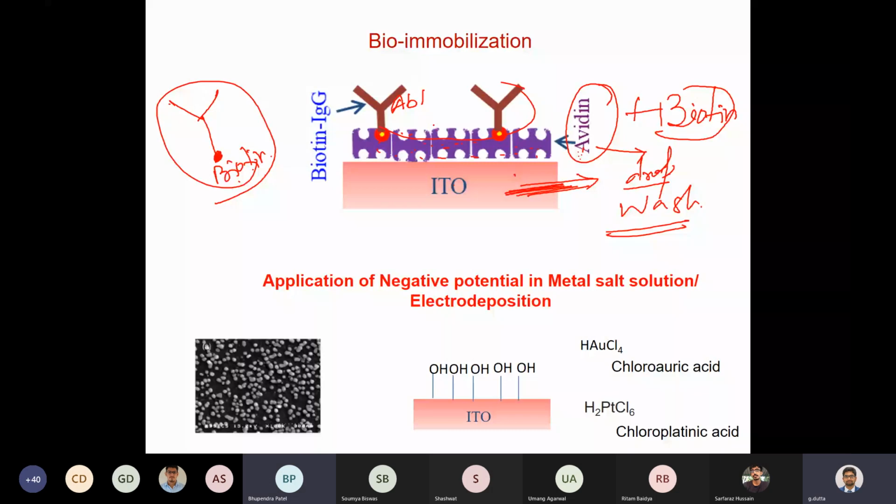So is this for the primary part or the secondary part or both? Now, this is the primary antibody part I am saying. I mean to ask whether, for linking the antibody, this step is for the secondary one also, or just for the primary part? Is this linking the same for both parts or different?